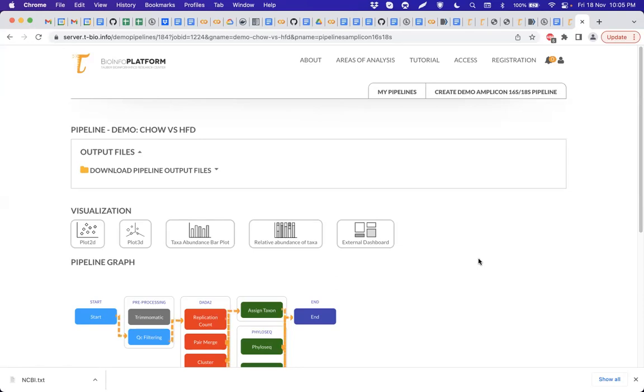You don't have to do that, but the algorithm does. The algorithm creates a probability of two specific reads being with each other. You will see this when we discuss QIIME's pipeline, where I'll tell you where ASV is defined.